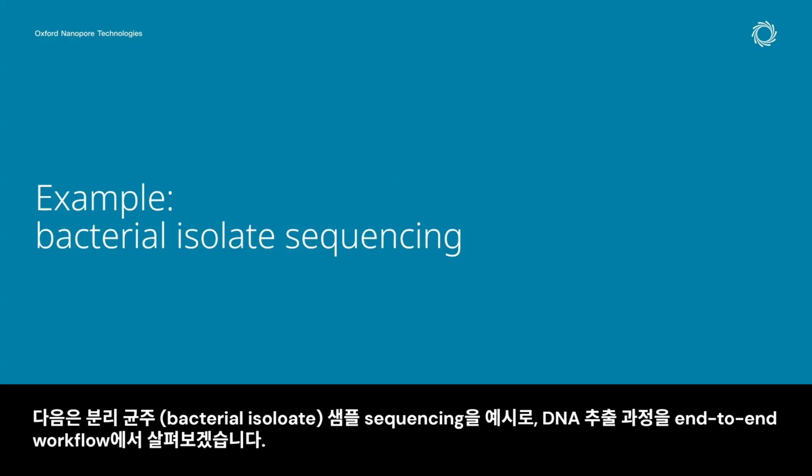Now let's take a look at bacterial isolate sequencing as a worked example of the extraction step within an end-to-end workflow.